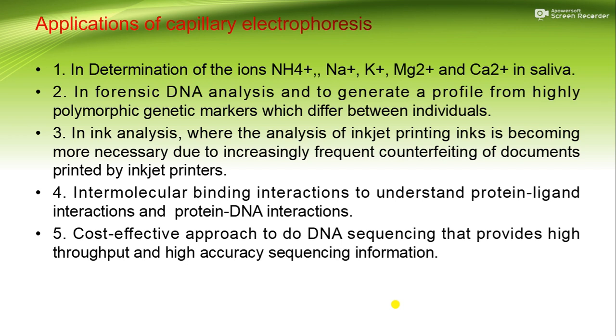4. Intermolecular binding interactions to understand protein-ligand interactions and protein-DNA interactions. 5. Cost-effective approach to do DNA sequencing that provides high throughput and high accuracy sequencing information.